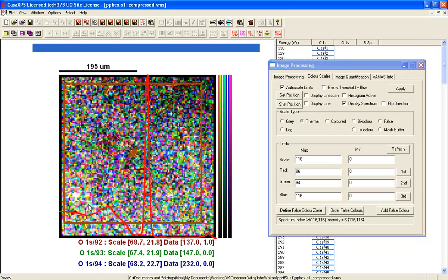We can also overlay the oxygen 1s, and again here's a classical shape for oxygen 1s, and similarly this is a silicon 2p, and these represent signal from a substrate which is silicon dioxide. The act of summing the pixels is providing an average spectrum, and hence we can see significant features in these data.